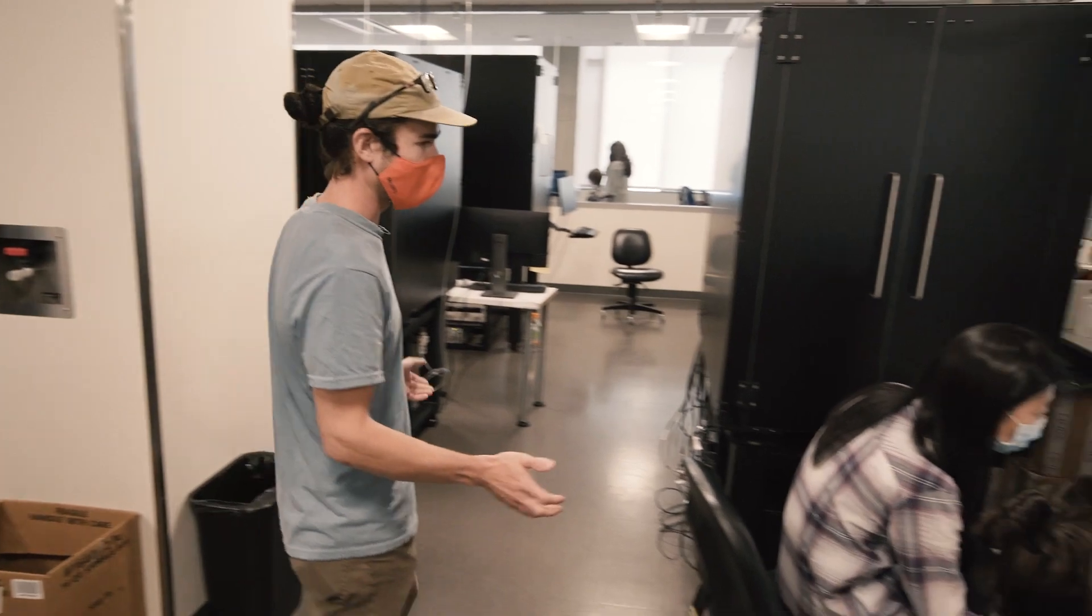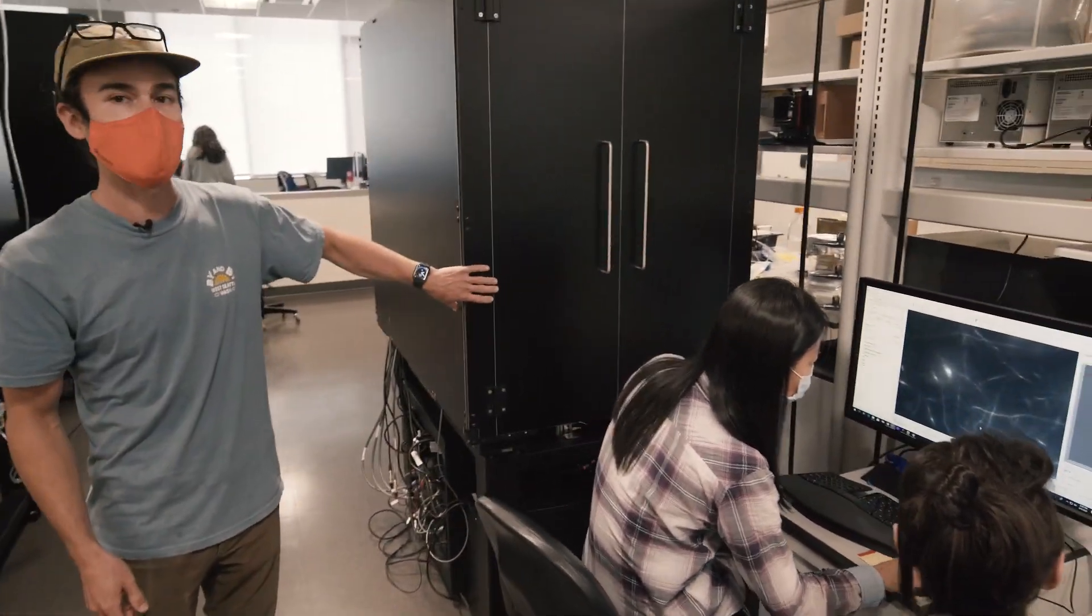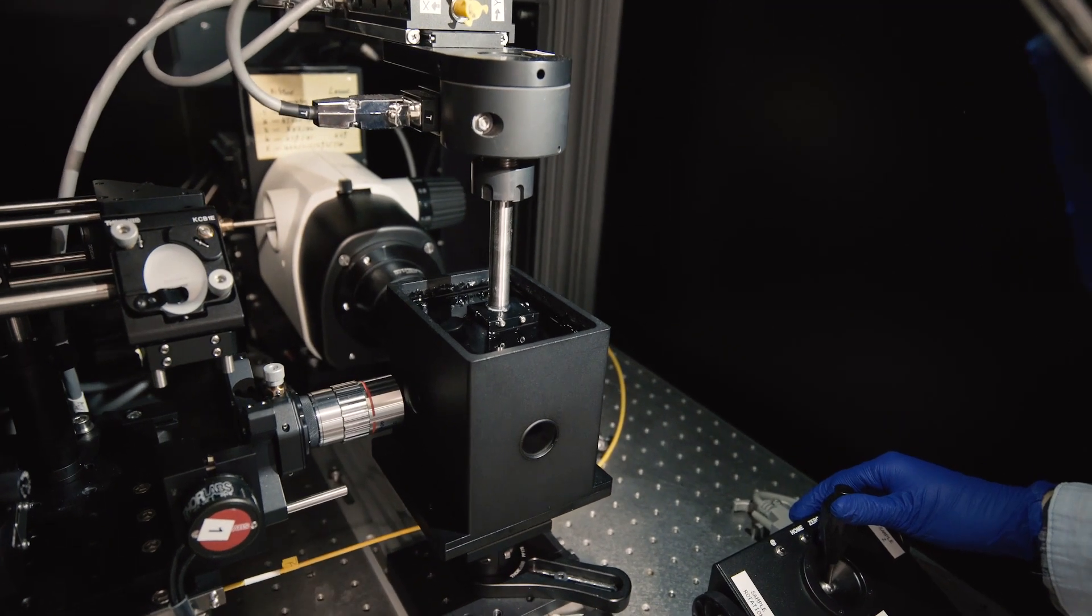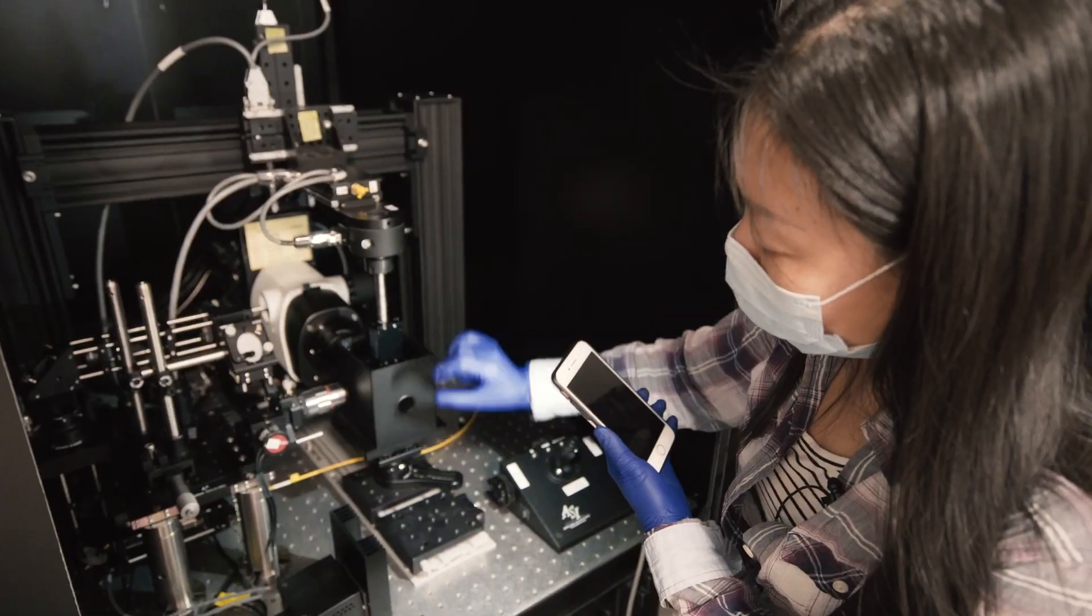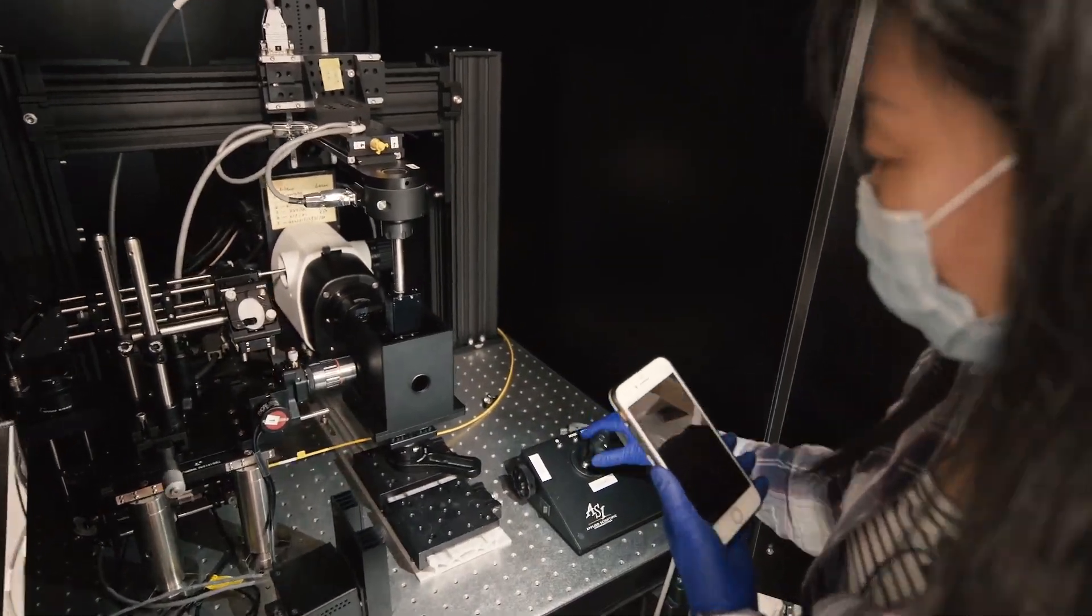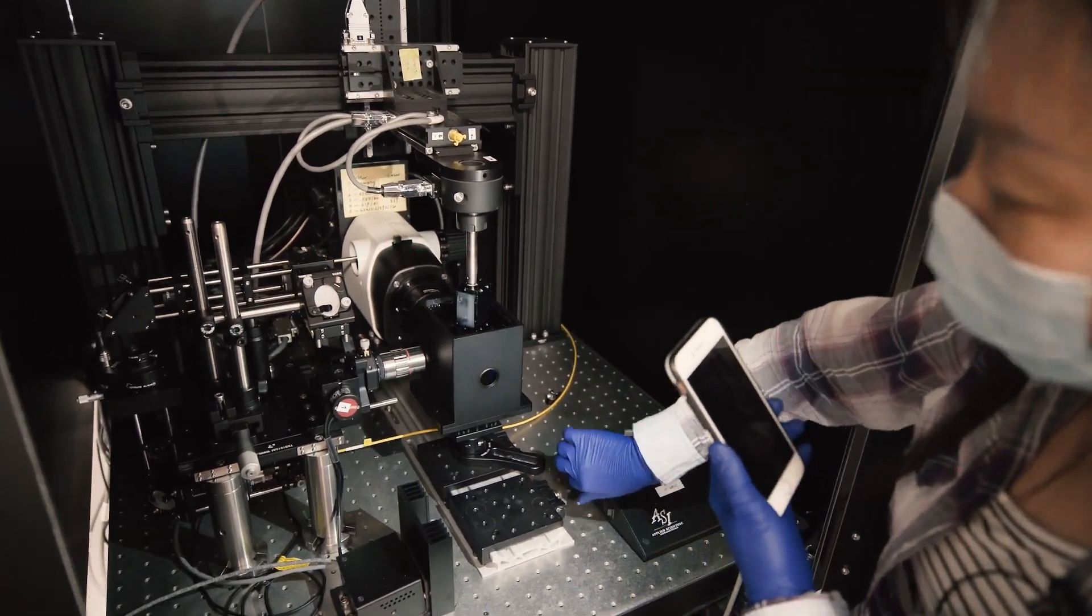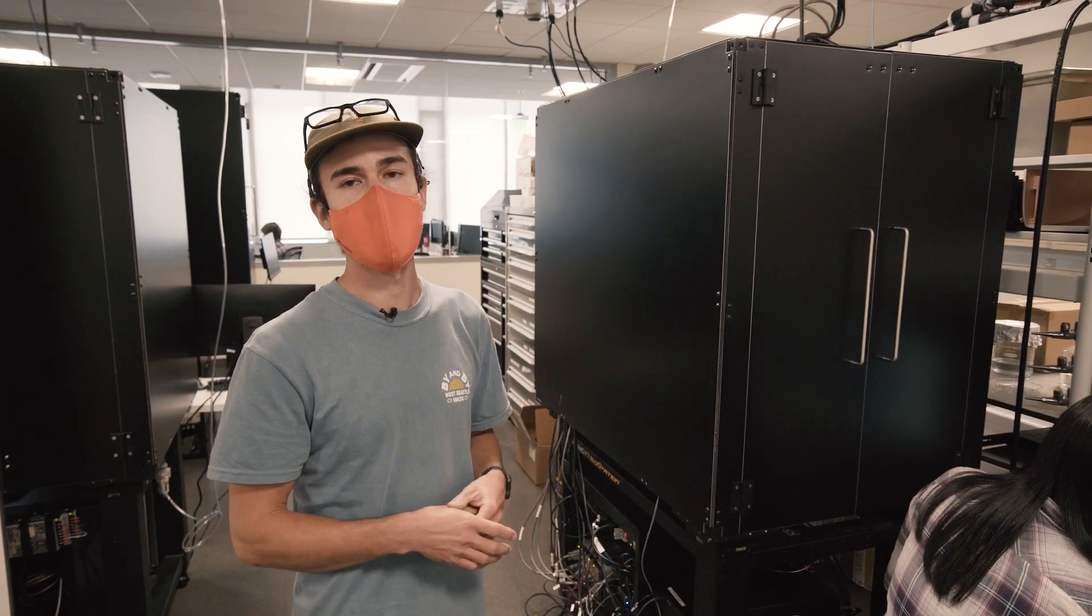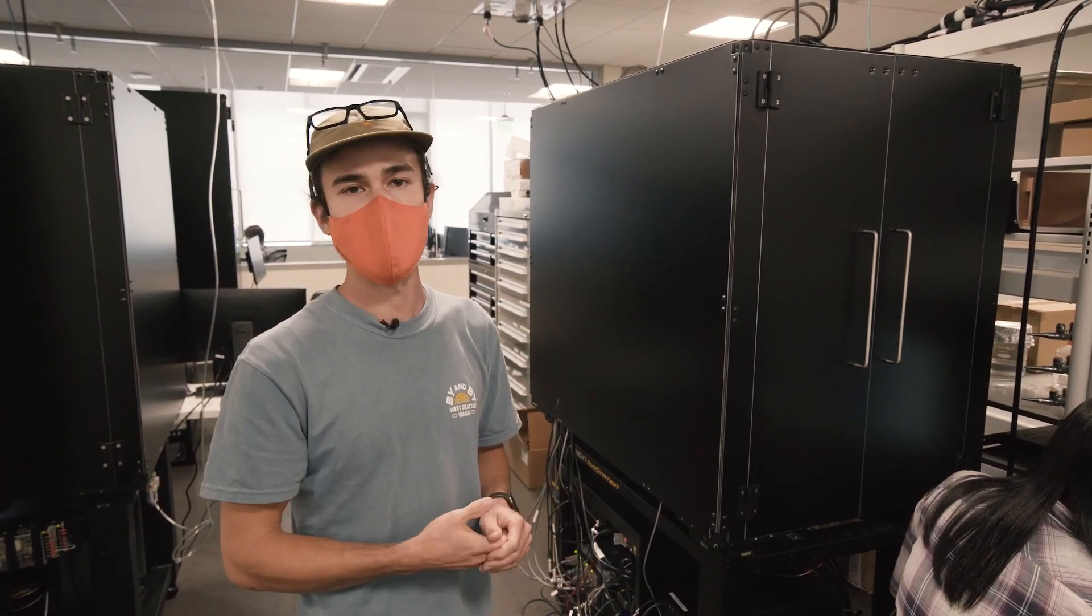Here we have a number of different microscopes. One of them here is called a mesospim which stands for a mesoscale selective plane illumination microscope, which is a mouthful but I think light sheet microscope makes a lot more sense. The way that the microscope works is you shine a sheet of light through the brain and then you take pictures of that sheet of light.